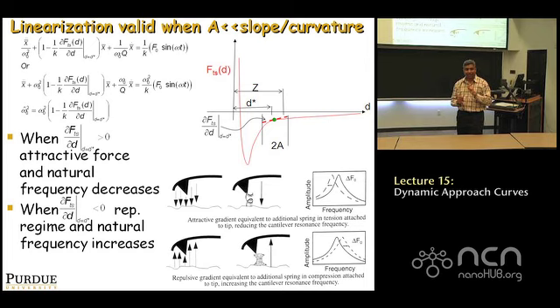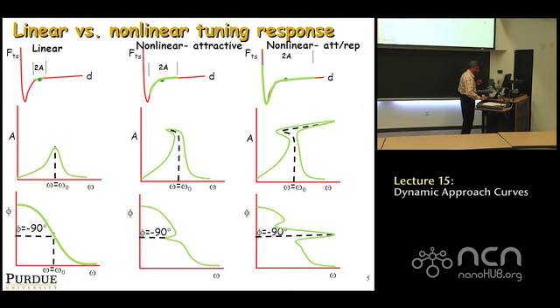That doesn't mean that it does not touch the surface, right? As shown on the right here, your oscillation could go down and the tip sample interaction force could become a little positive also. But so long as the net interaction force is negative, we would call that an attractive regime oscillation as far as tapping mode is concerned.